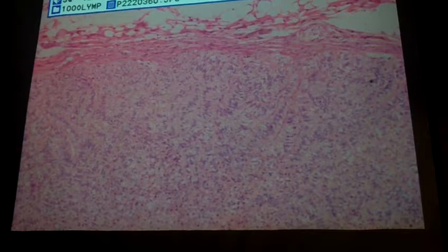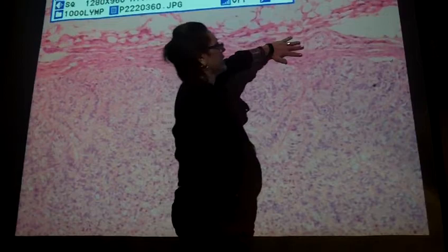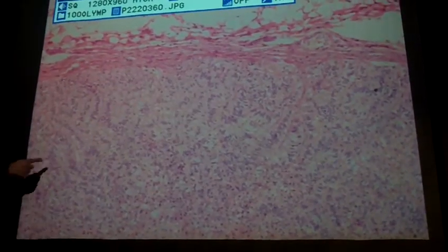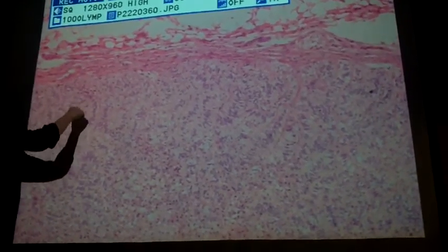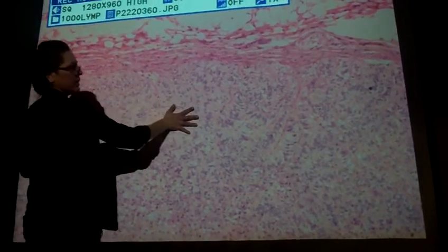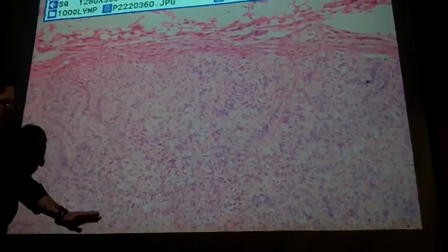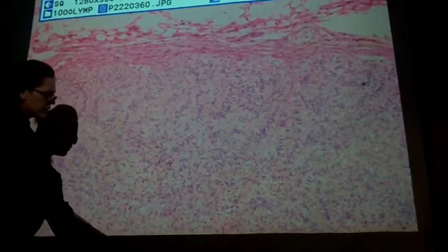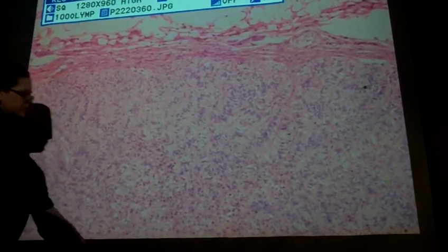So this is at the top again. This is the capsule. And again, you can see the fibers running horizontally. And then here you can kind of see swirl, swirl, swirl, swirl, swirl. That's all glomerulosa right here. Down here at the bottom, the cells are kind of swirling a little bit, but down here they're going to stop doing this swirling orientation. Fasciculata.